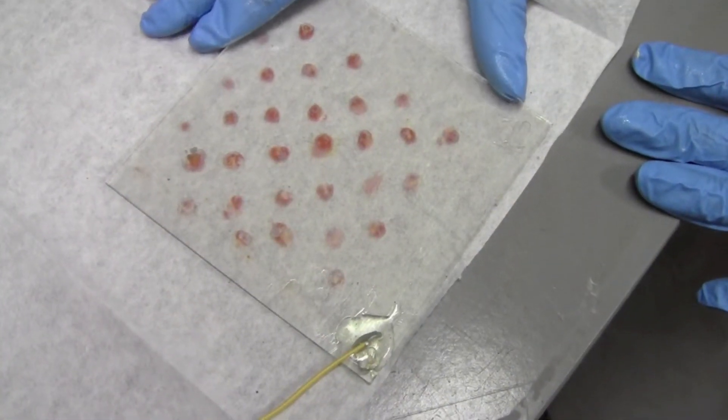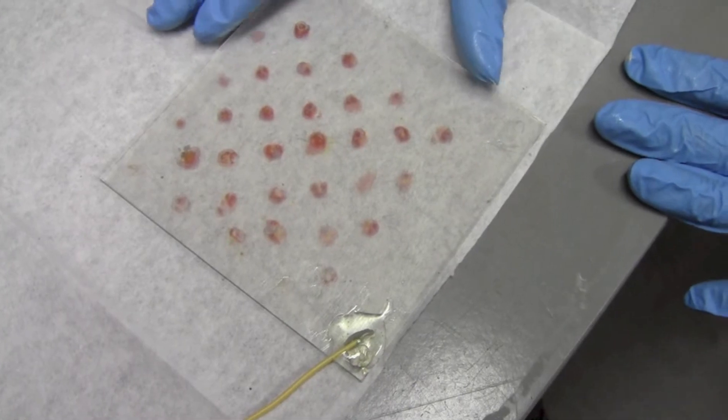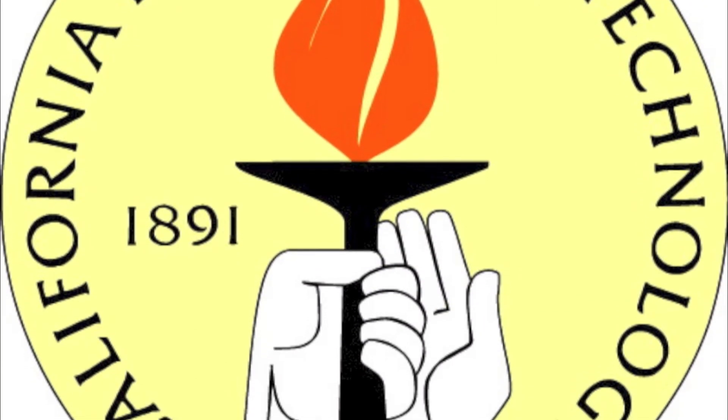This is the finished product and you are now ready to perform a scan. Let's go ahead. Thanks for that.